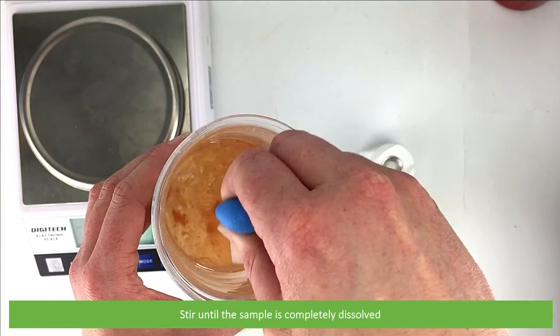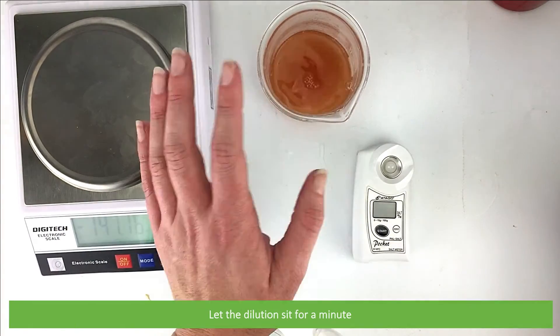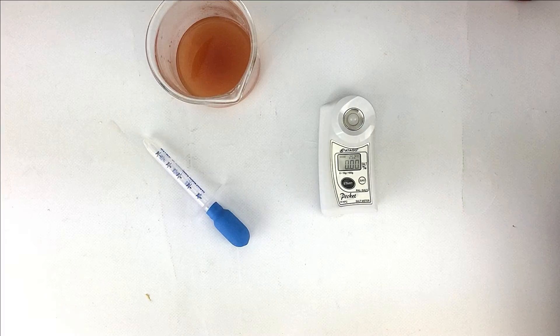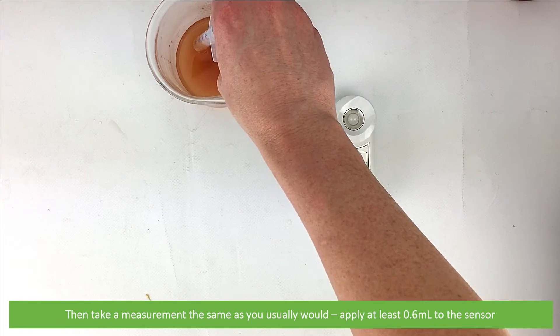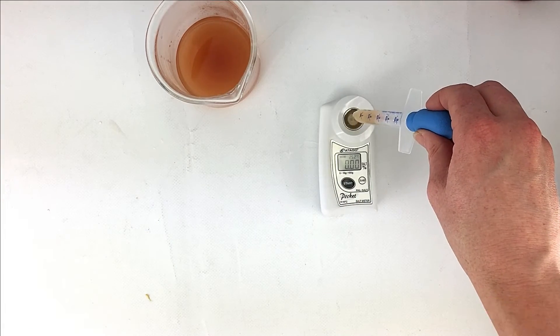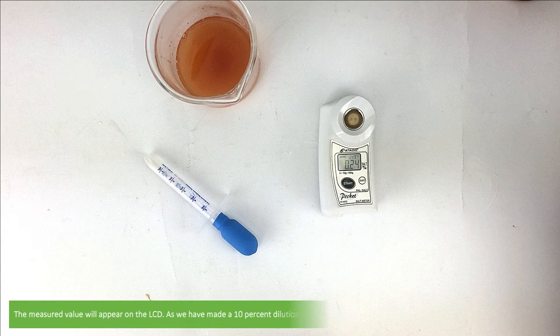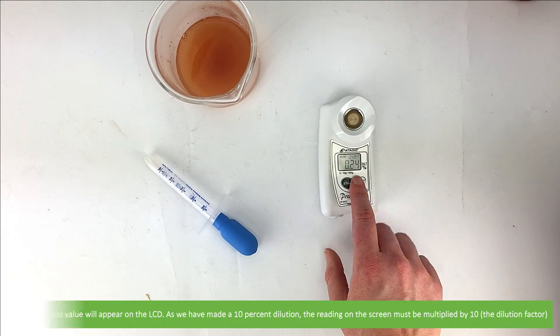Stir until the sample is completely dissolved. Let the dilution sit for a minute, then take the measurement the same as you usually would. Apply at least 0.6 mls of sample to the sensor and press start. The measured value will appear on the LCD. As we've made a 10% dilution, the reading on the screen must be multiplied by 10 — the dilution factor.